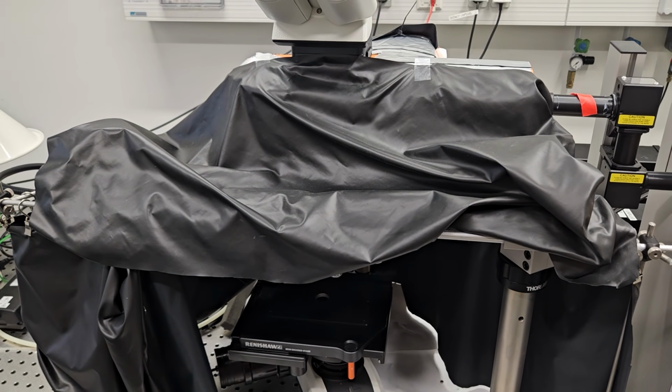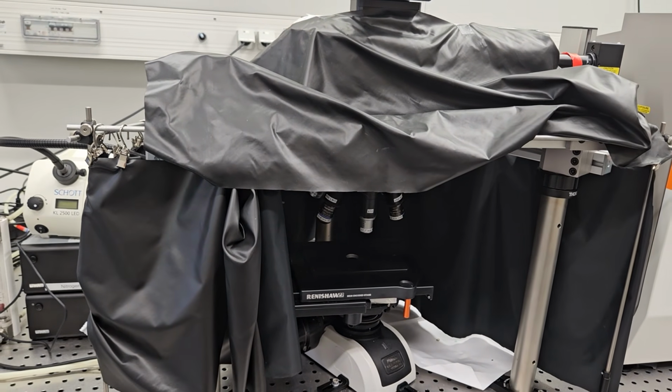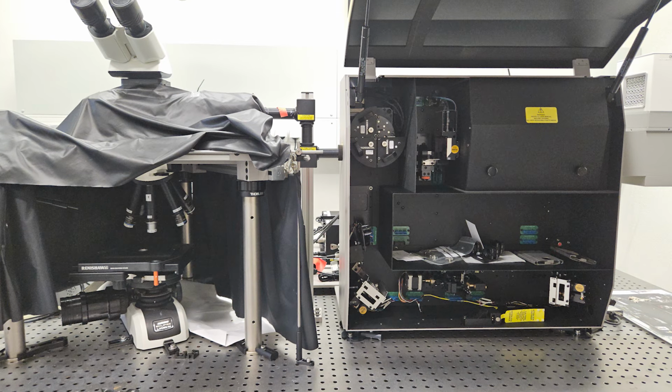Raman spectroscopy. After I shot this video, it's now one of my favorite analysis methods. Today we are at Dr. Lentin's lab to carry out and explain this analysis method. Here's a quick summary. The Raman effect, which is used in this method, works as follows.